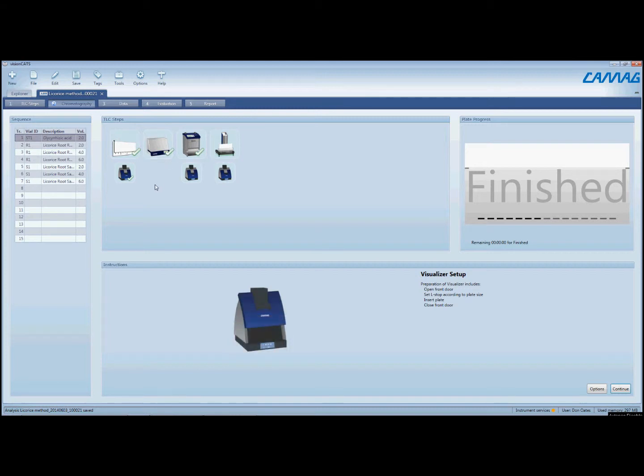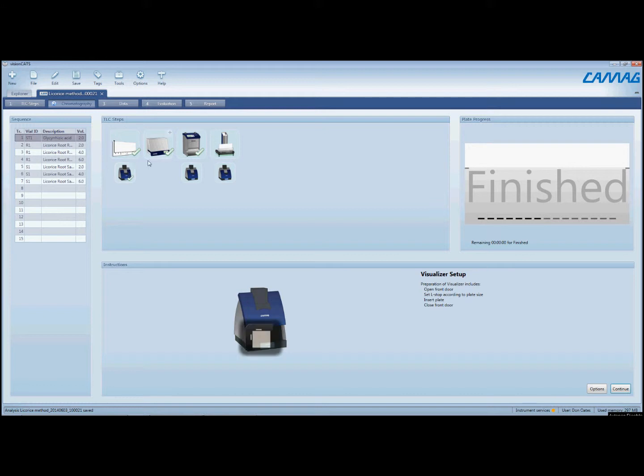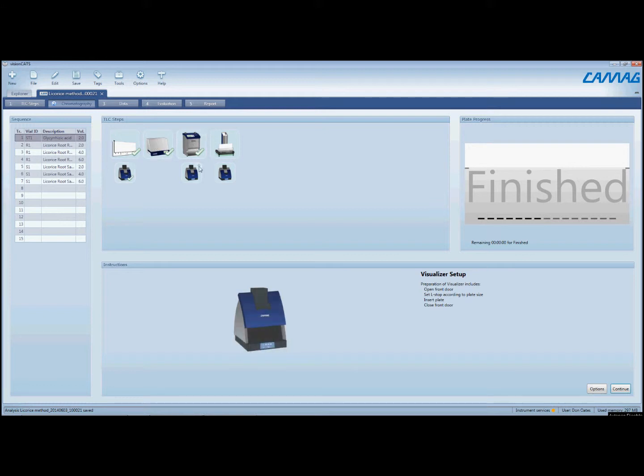So we have completed the clean plate imaging, the sample application, we just completed the development step, and now we're going to acquire images after development.